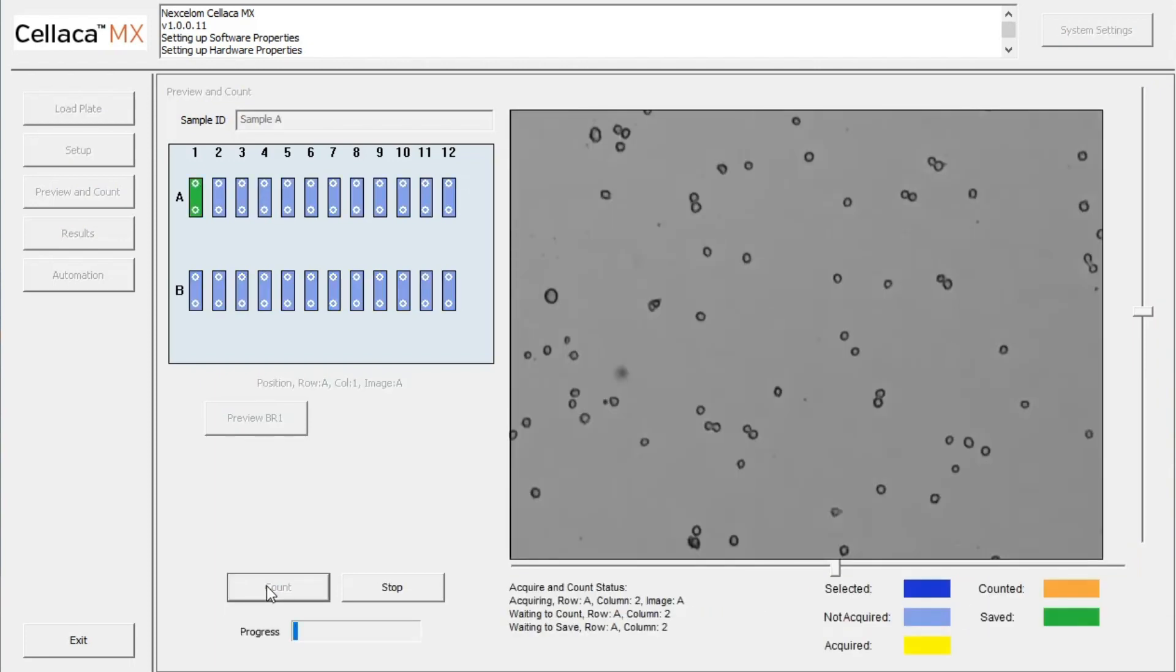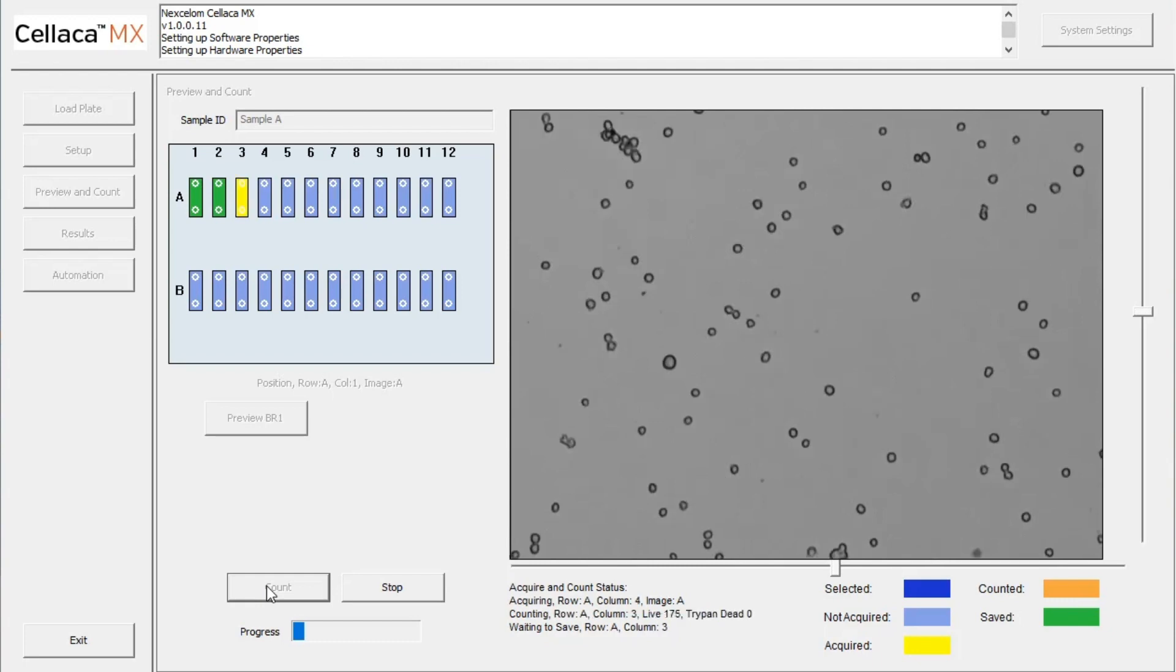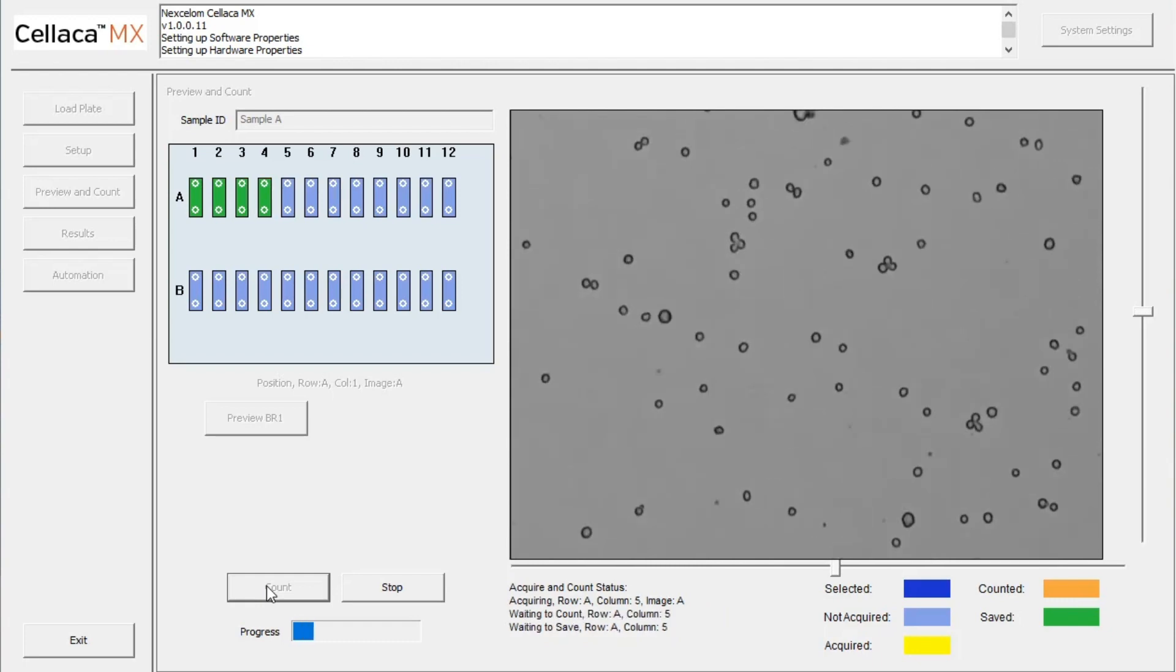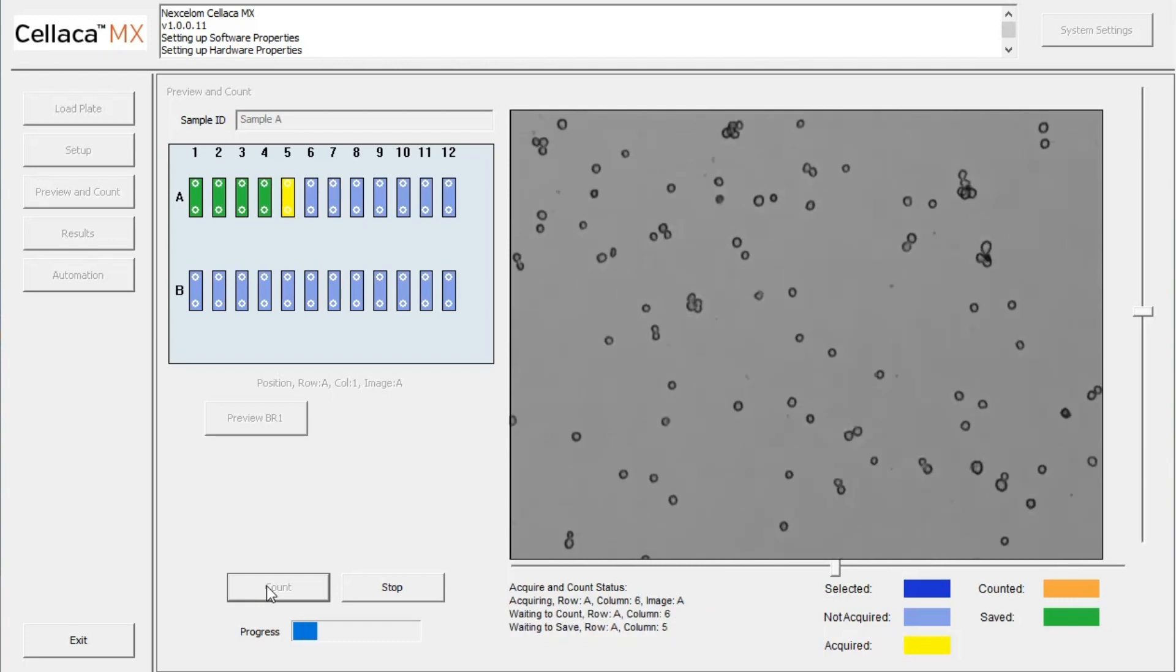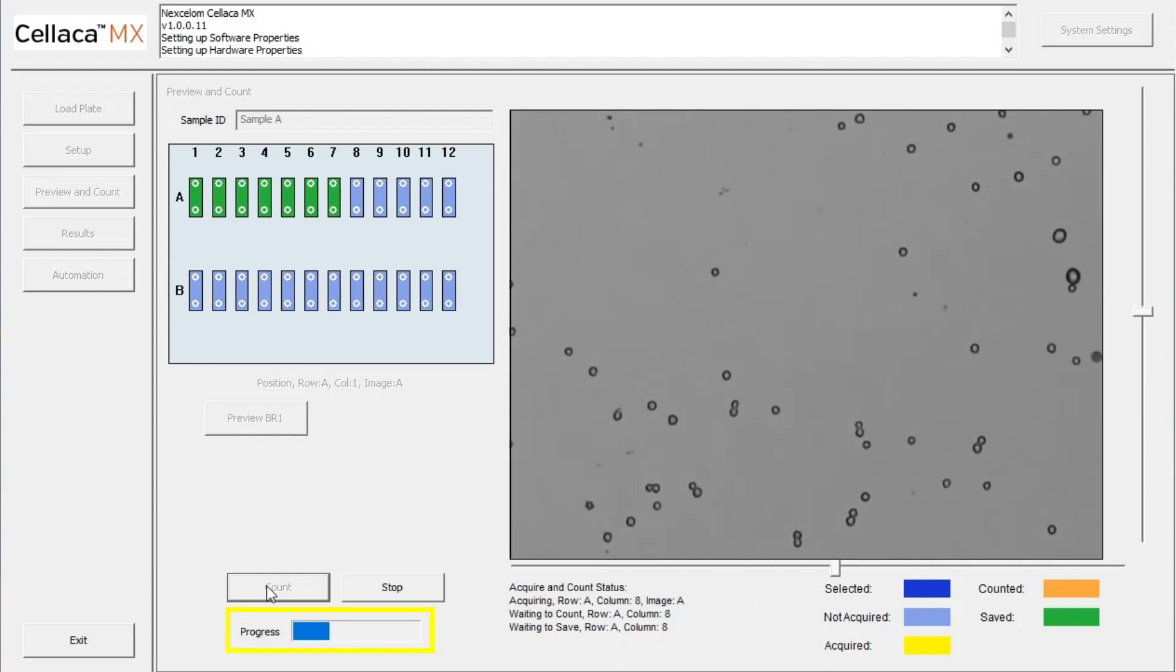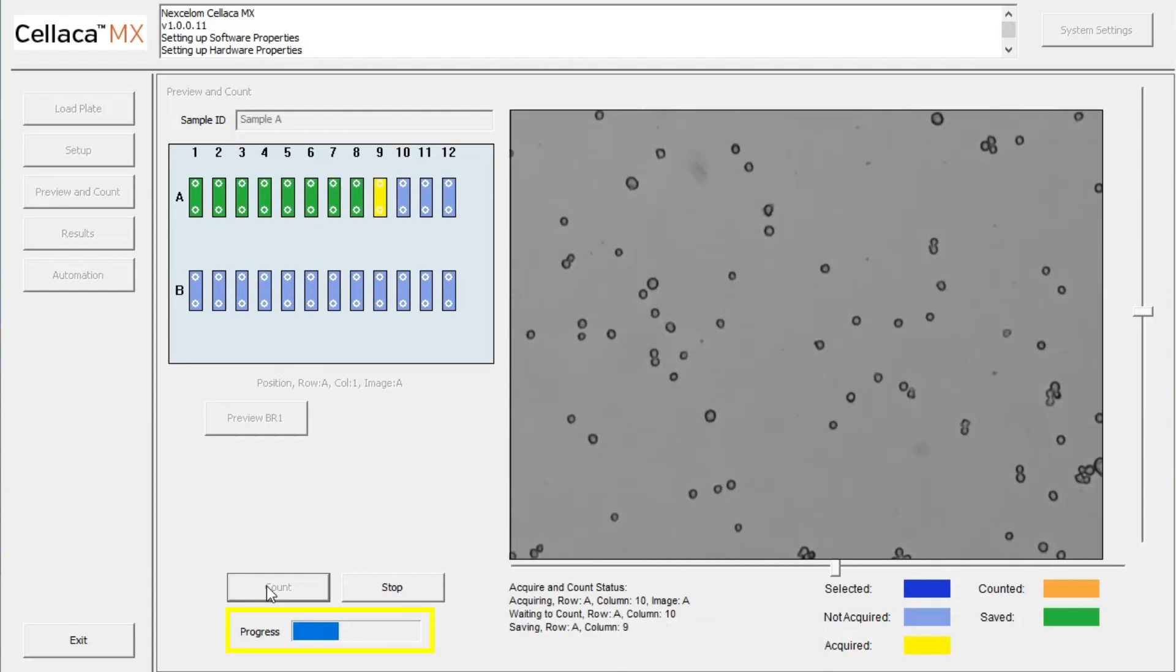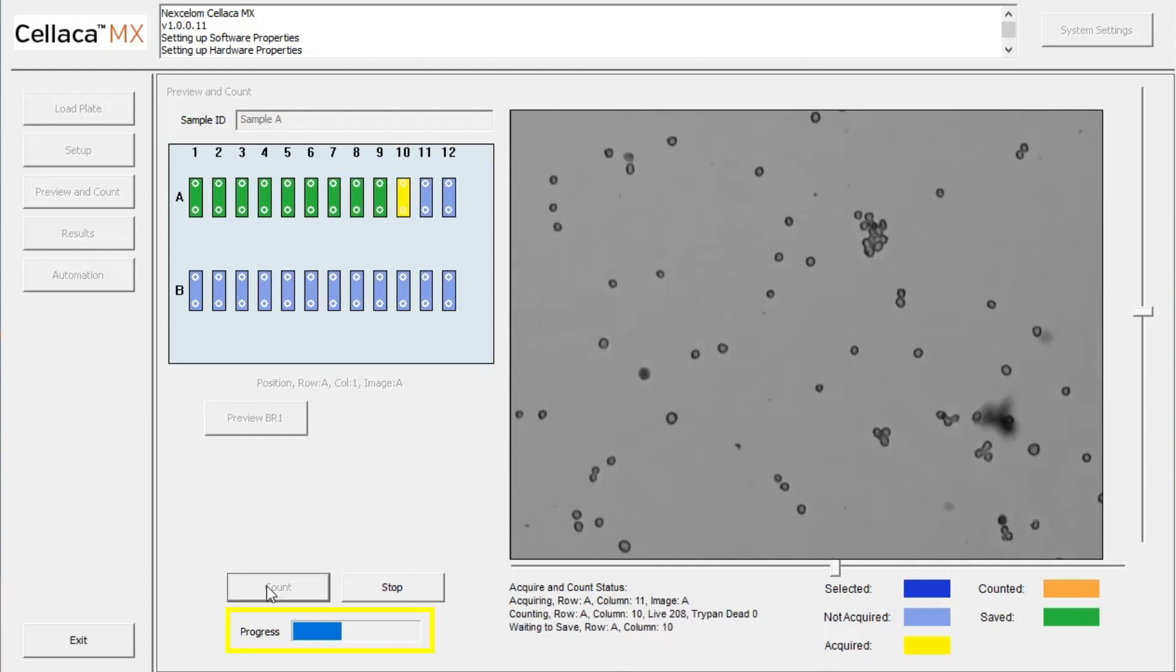In less than 60 seconds, the Cellaca MX images all 24 samples and analyzes the images based on preset parameters. The progress bar allows you to monitor the scanning process in real time.